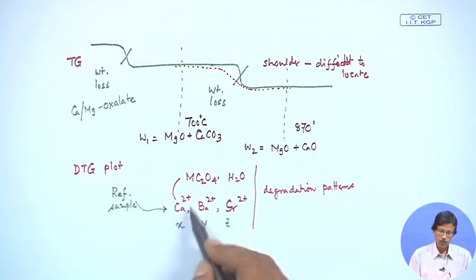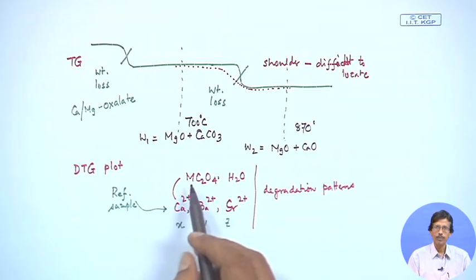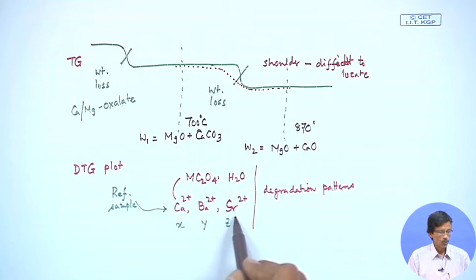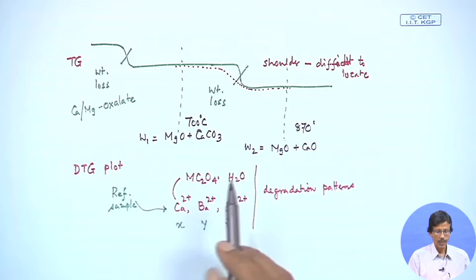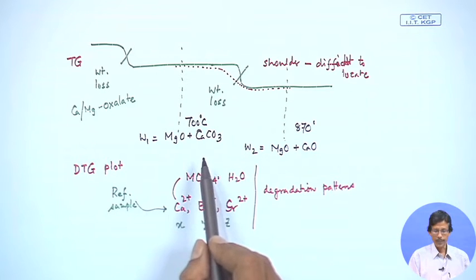Then with respect to the corresponding calcium compound, because we know what amount of original sample we are heating, we can find out the barium amount or the strontium amount. So, these are very good examples. The only thing is that their temperatures will be different, depending upon their loss, like that of magnesium and calcium, whether carbon monoxide or carbon dioxide or all together, for this particular purpose.